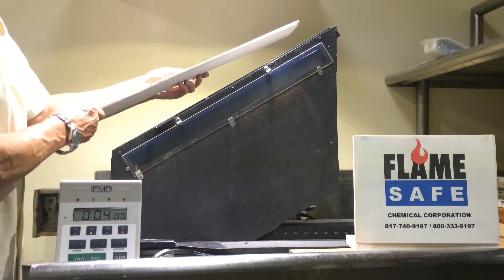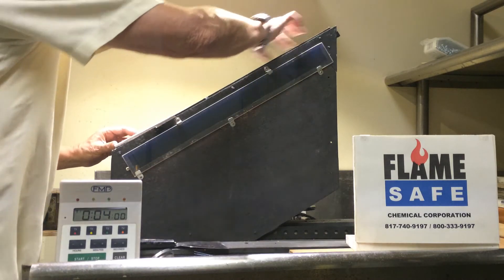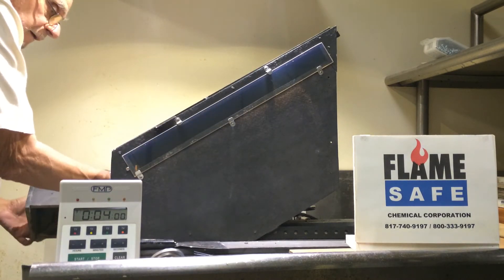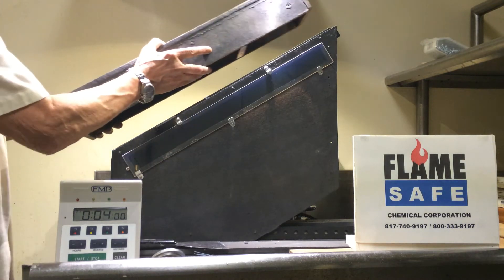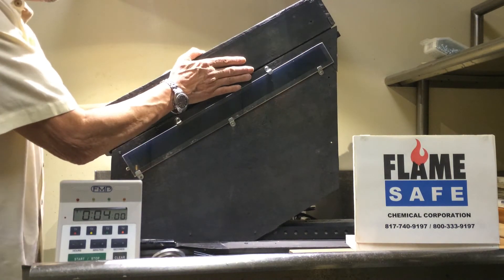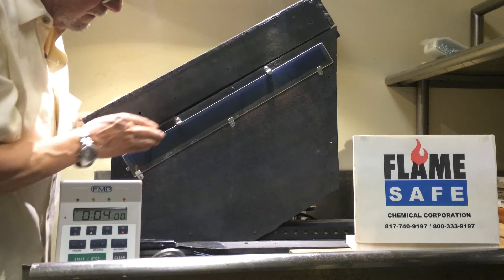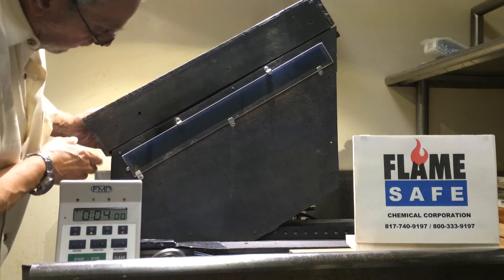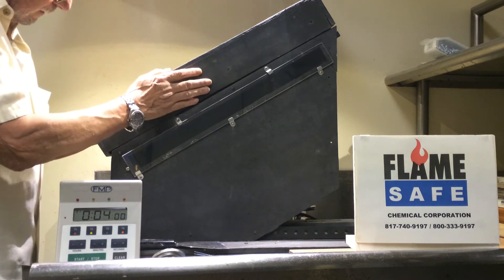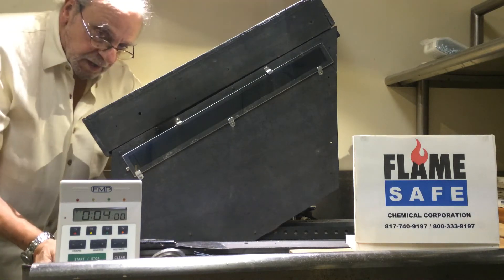This is a cementitious board that is placed over the specimen in the tunnel. This test usually runs about four minutes.